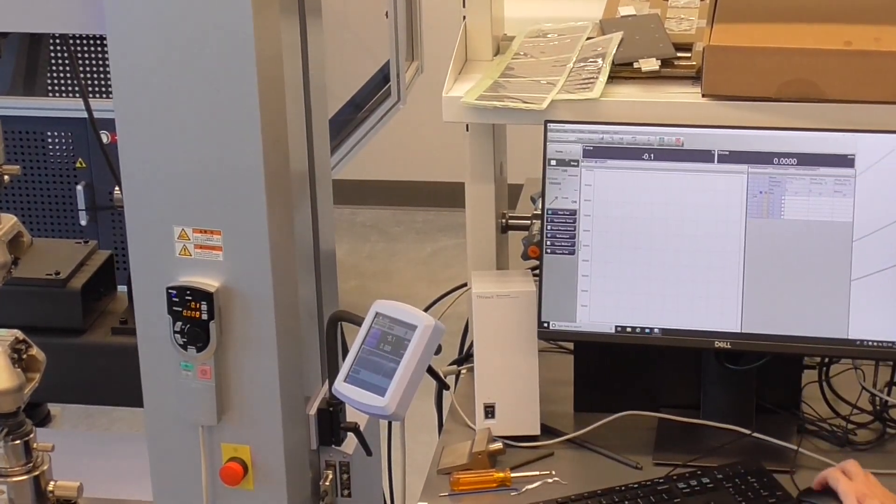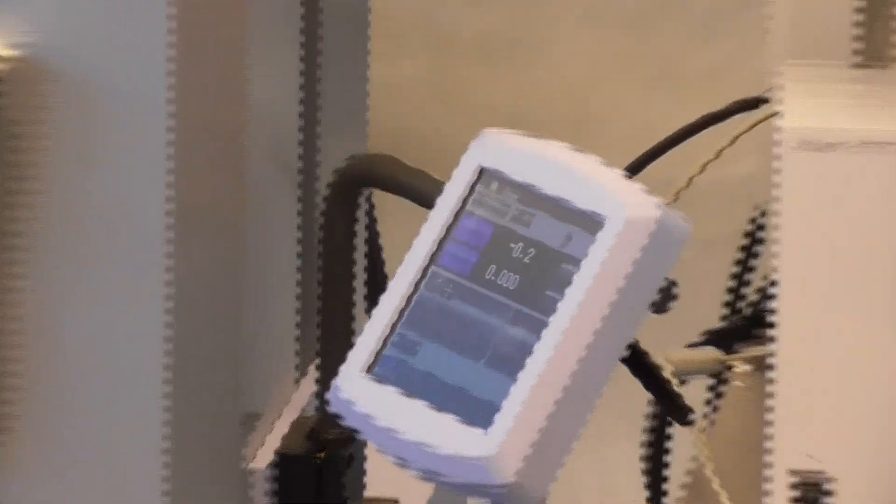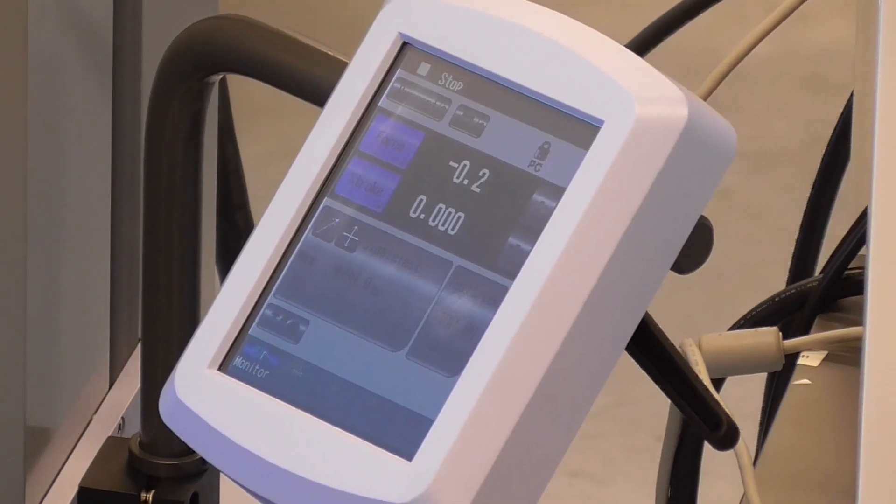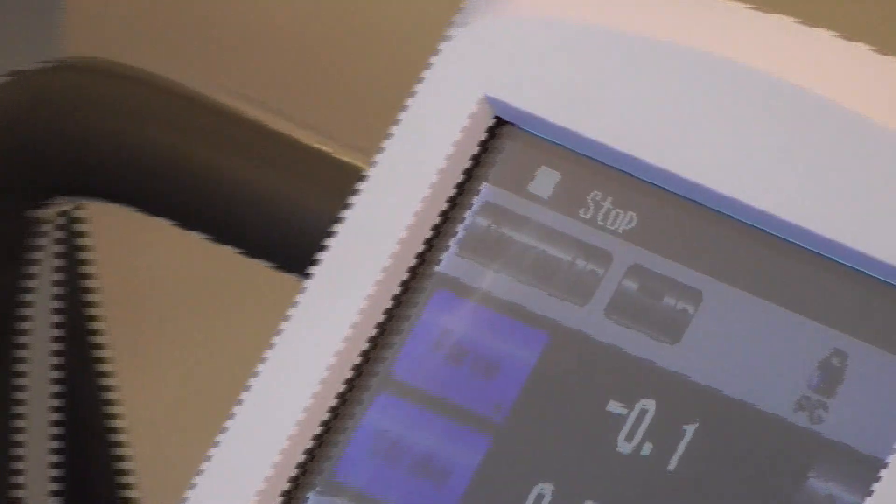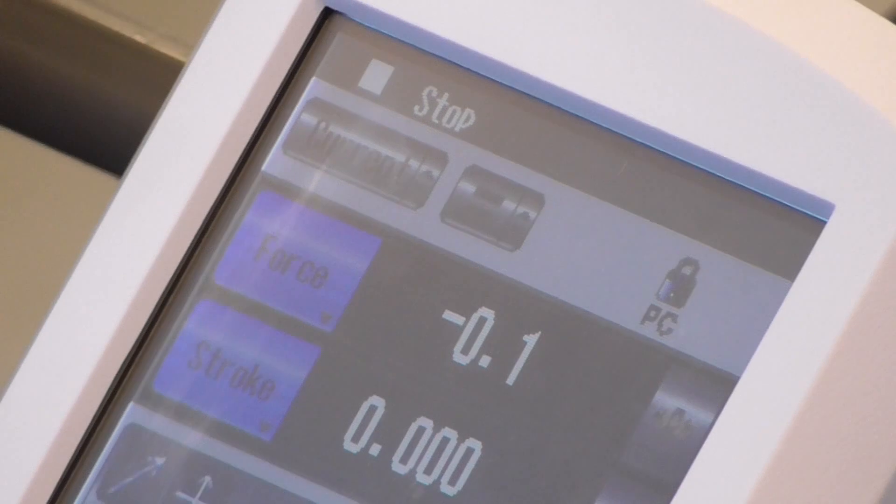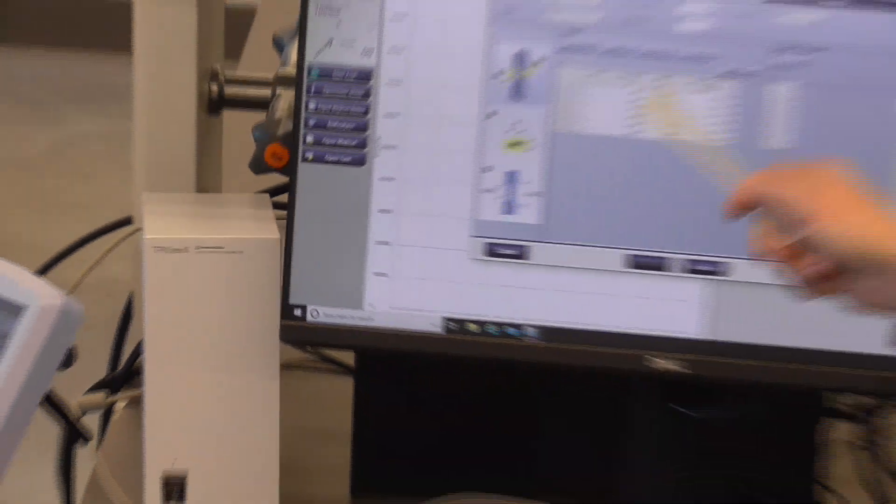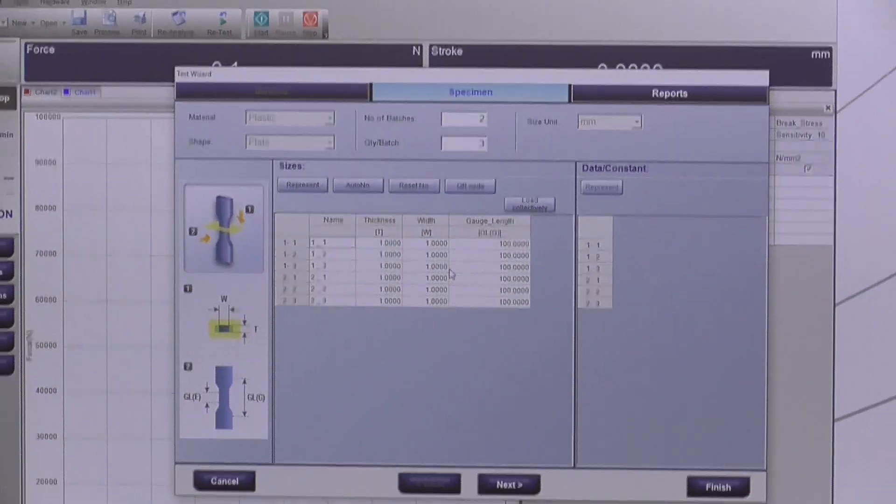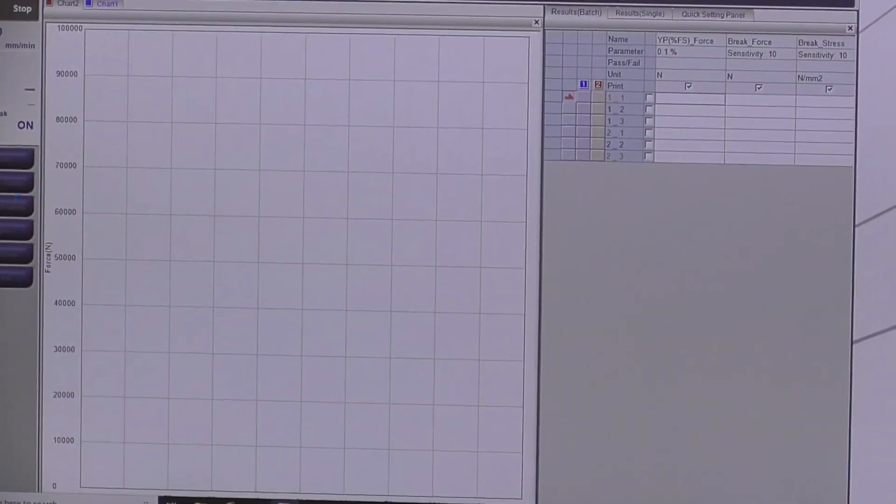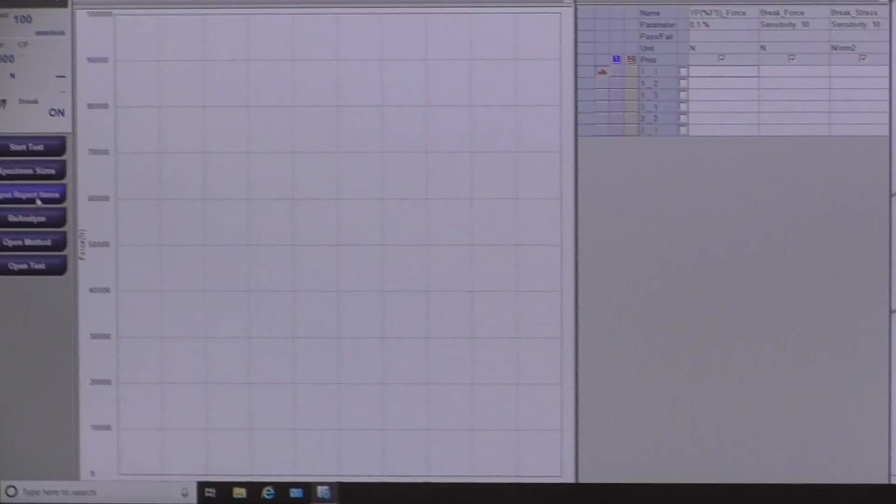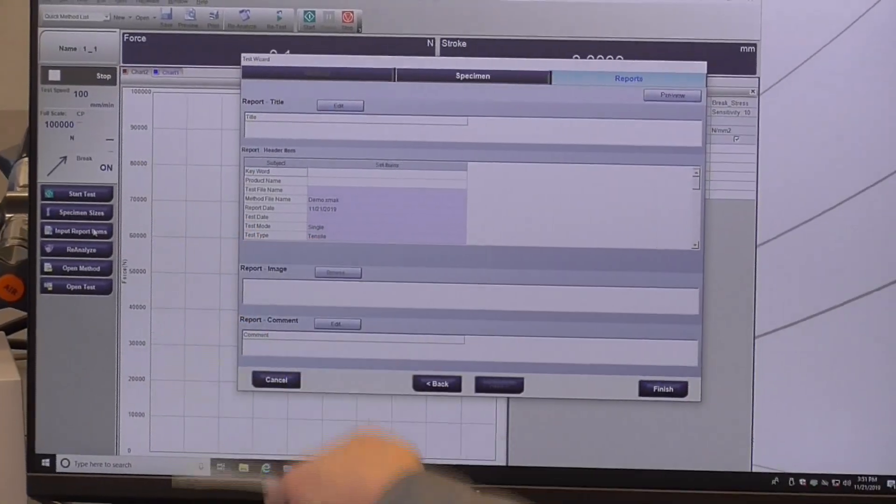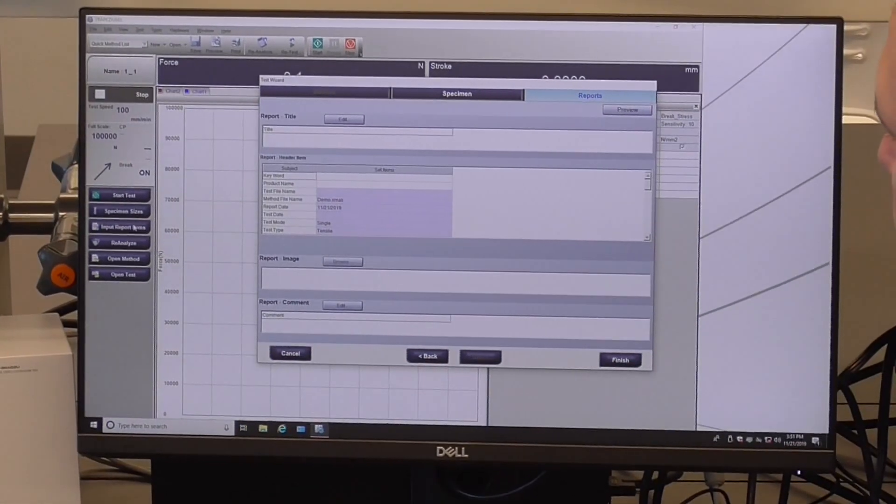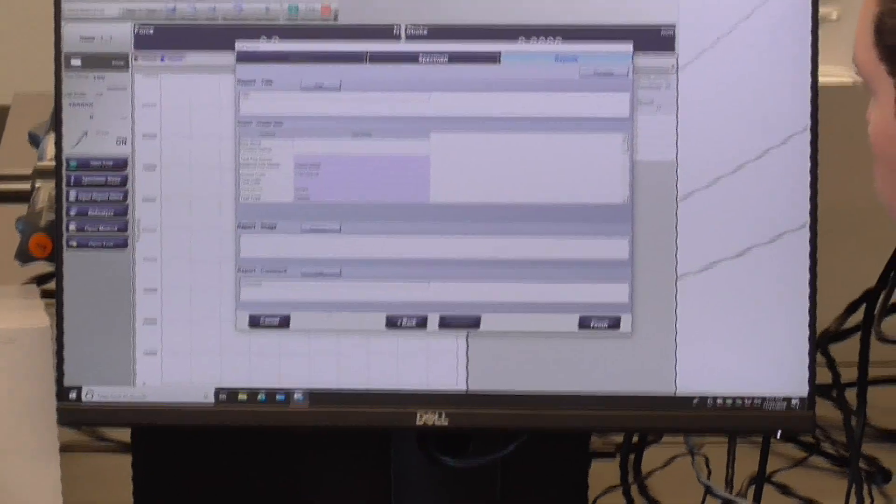So like I was saying, when you're writing the method, you can write in your specimen sizes. Rarely, when you're writing your method, do you know your exact specimen sizes. So, specimen size right here, you can bring it up. Add all your specimen sizes as you're micing it up before you run the actual test itself. You can also change some of the report parameters that you want from the buttons on the left.